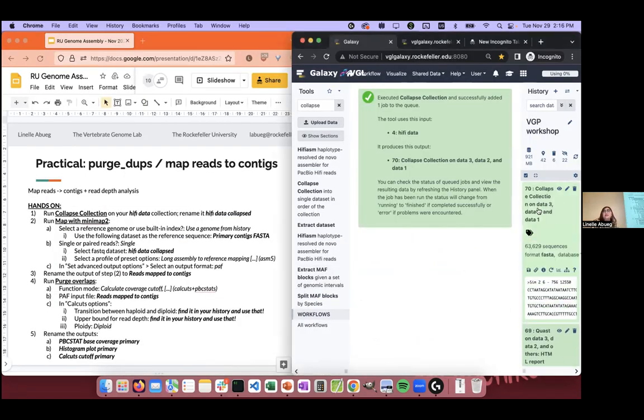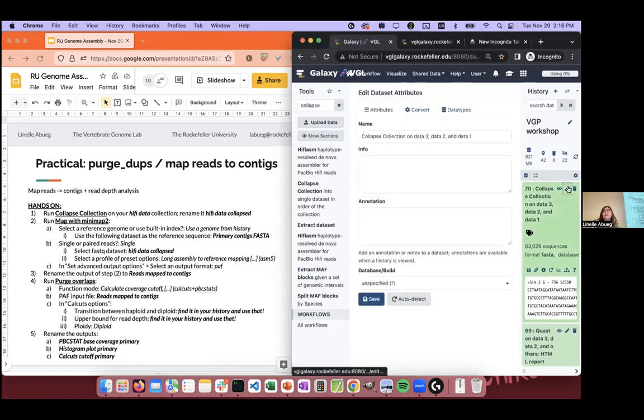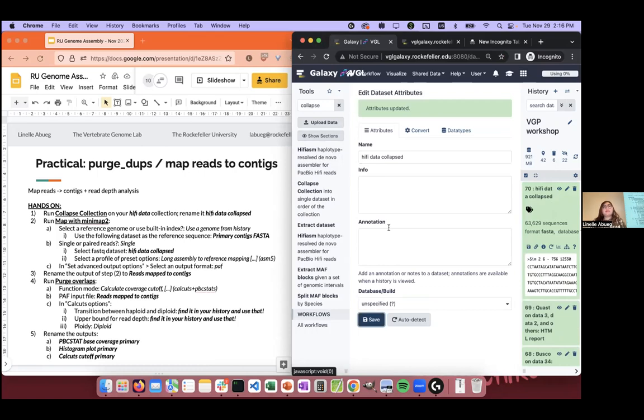Mine's done, so I'm gonna go ahead and rename it to HiFi data collapsed. Save.